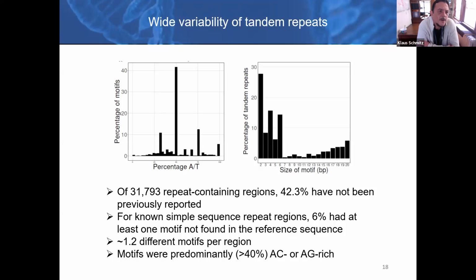But in order to know what is rare, we need to have some other basis. So we use the 1000 Genomes Project data to set the frequency, just like what we typically do with exome sequencing or whole genome sequencing. There's gnomAD that you can check the frequency, right? So that's the frequency that you will check, instead of using the internal frequency, because we want to do the statistical comparison unbiasedly.